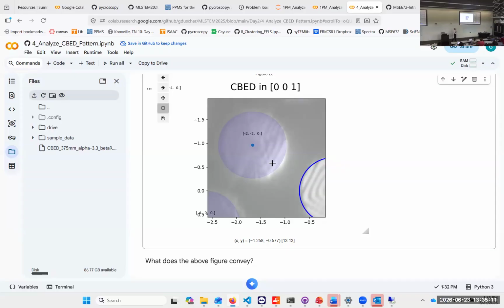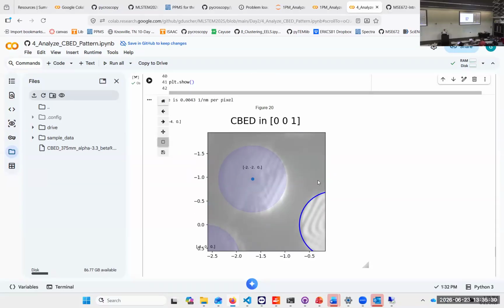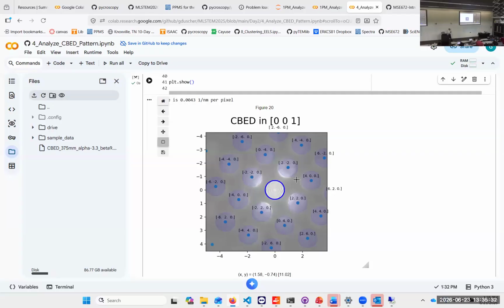The simulations that we had, it took a minute or two. So by the time you're at these large thicknesses, you have quite a problem to realize them. So the idea is always to minimize in this case the simulations, and try to find as much out as you can so that you're approximately in the right order already. And so just finding the center of these disks is important.